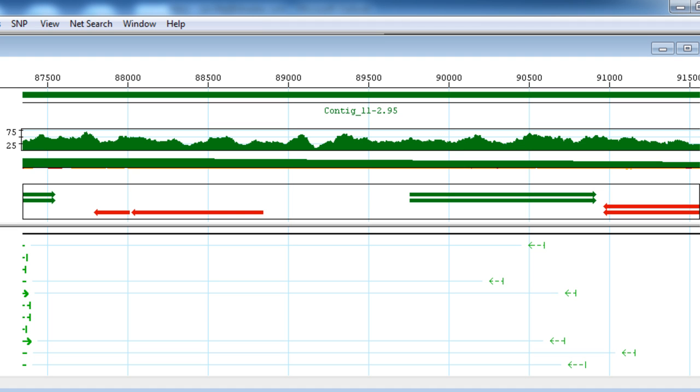You can then repeat these steps for other scaffolds to easily merge more contigs in your bacterial genome or other de novo assembly project.